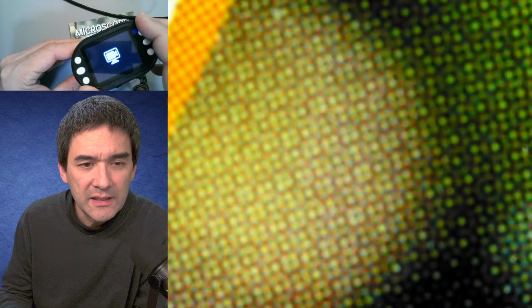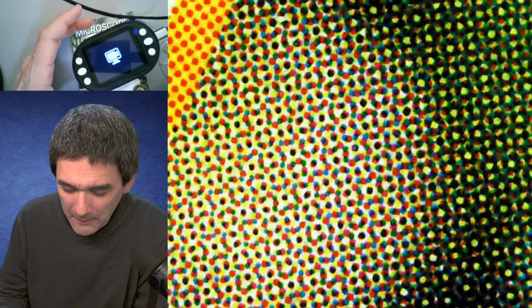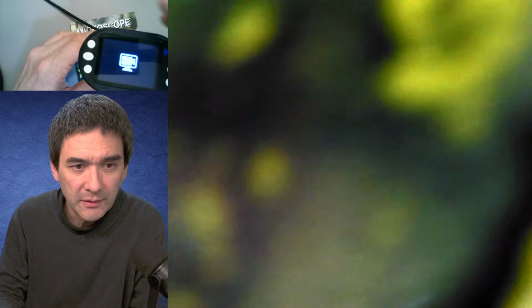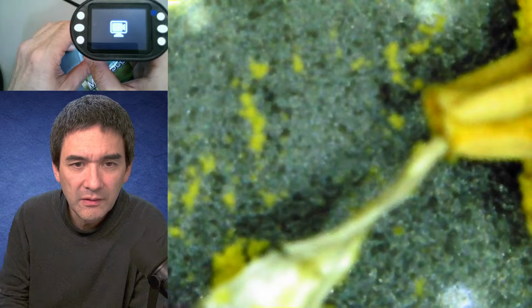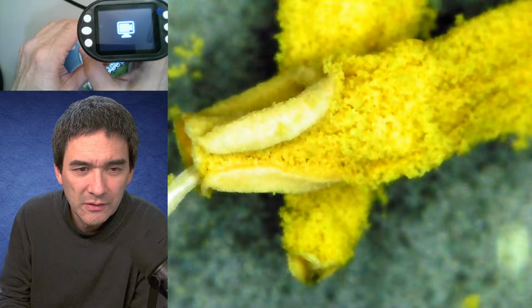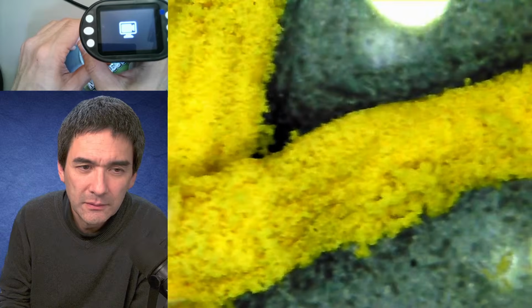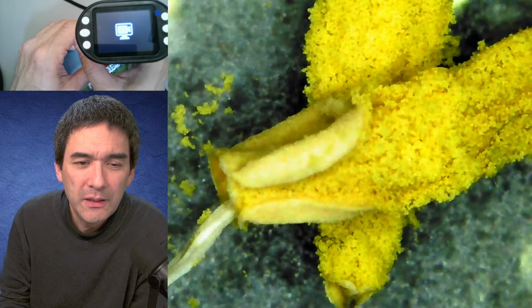So that is basically like a stereo microscope without the stereo part, where you can simply look at the things directly. Look, I've got this from a couple of weeks ago. These are basically the pollen, the anthers. Remember the middle of February when I put the flower under the microscope? The pollen, the anthers. So in that sense, it is possible to explore nature. Of course, a real stereo microscope will give you a much more impressive image, but I mean, it does work.